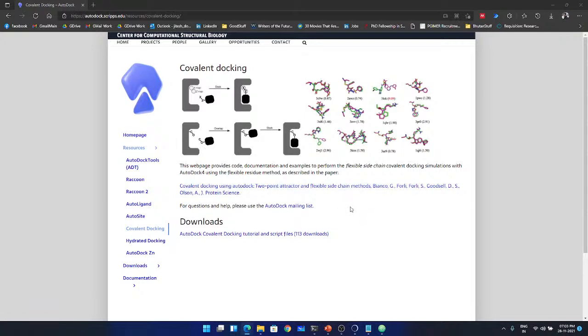How do we decide a perfect pocket of a protein for docking? Well, if your protein already has a co-crystallized ligand bound to it, some strong ligand, that's probably the binding site you're looking for. If there is no information about any binding pocket or active site, usually literature sometimes specifies the amino acids which are important for its activity, so those could be your targets as a binding pocket.